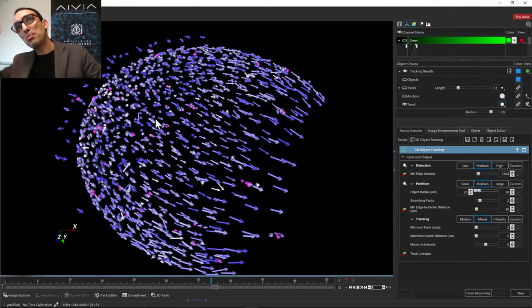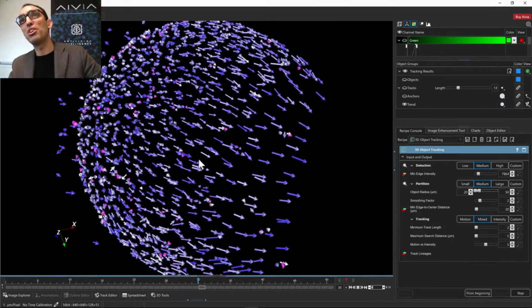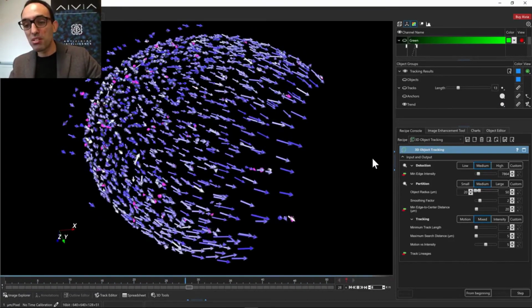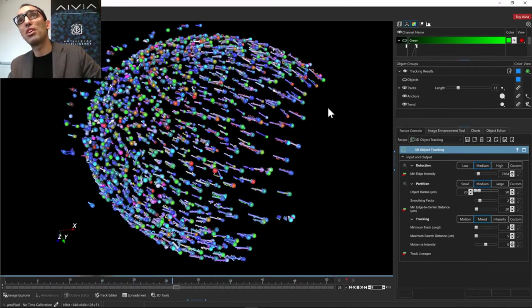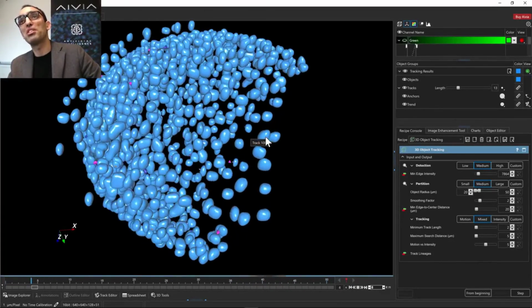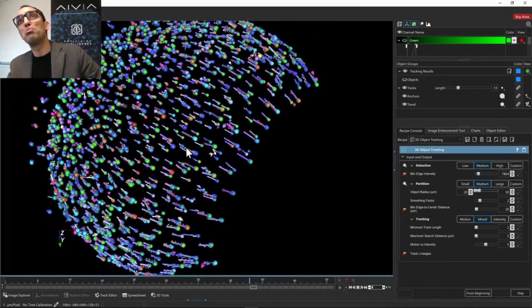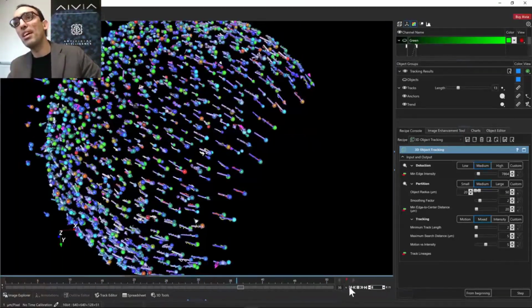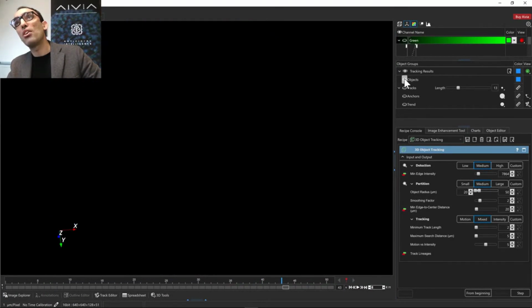And you can see when I adjust something, it takes a little bit to buffer that particular display setting, but after that it runs seamlessly and extremely fast for all this. And you can have all of this on, of course. The surfaces are the more expensive ones to render, so they take a little bit longer. But typically, you can choose a setting that is comfortable for you. So that is it in terms of options on this side.